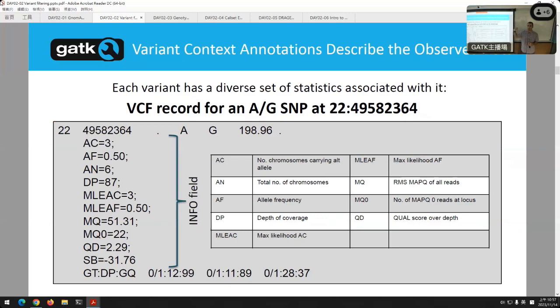In the next module, I'll explain the difference about the genotypes. This is whether the site is real or not. And so that's quality. So this is a Q score. So remember, Q90 is 99.9999999% confident. This is even more confident than that. So this is probably a real site.